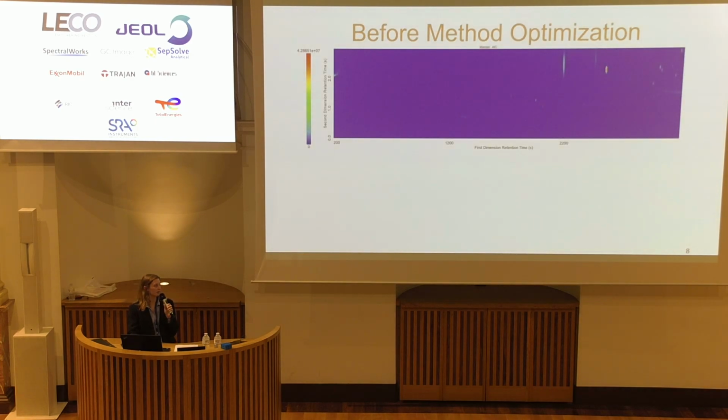This was one of the first chromatograms I obtained using fingerprint residue, and I want you to notice that most of these compounds are congested on the far right of the chromatogram and also the very top, with some wraparound of some of the peaks.